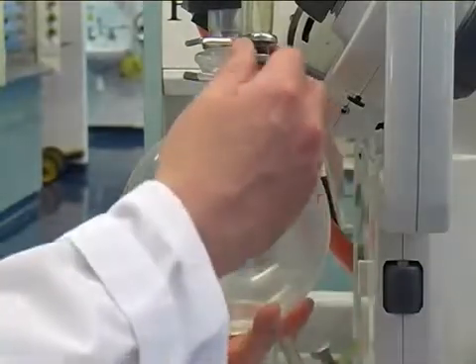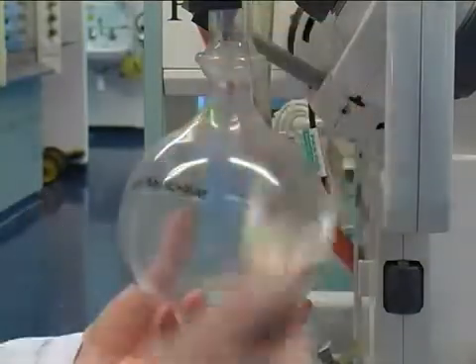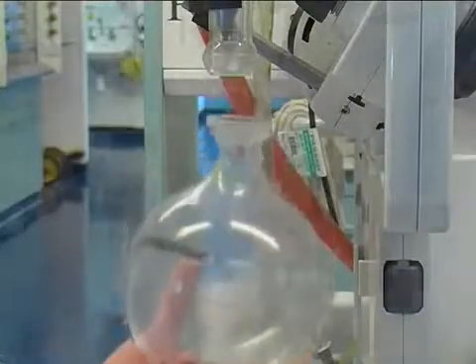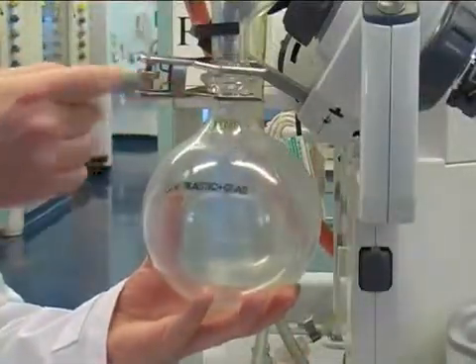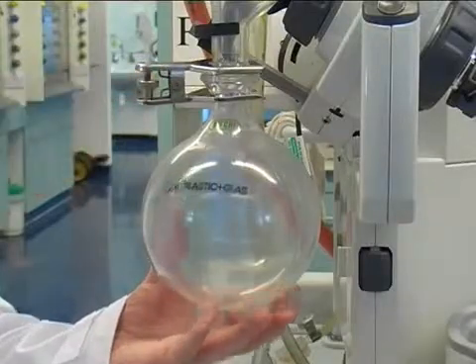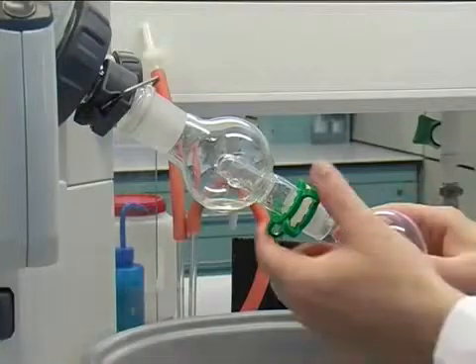Last thing that you have to do, please, is to empty the solvent reservoir. Depending on the nature of your solvents, put it into the halogenated or non-halogenated solvent waste. And don't tighten the clip too tightly because it's held by the spring inside.